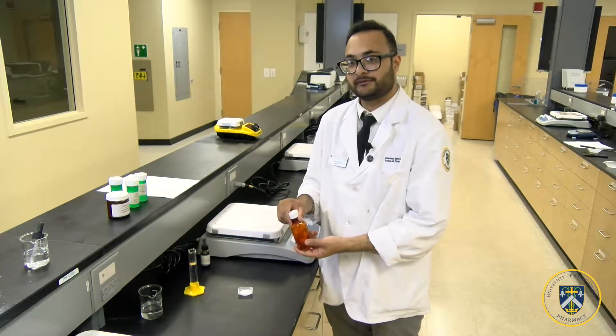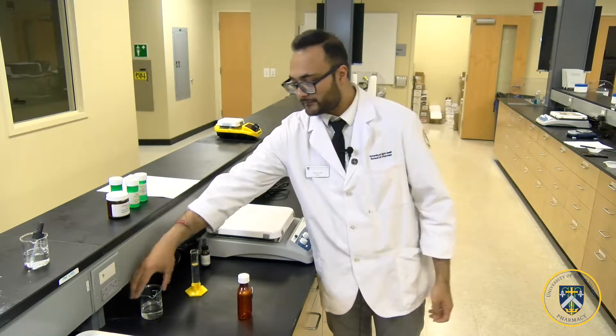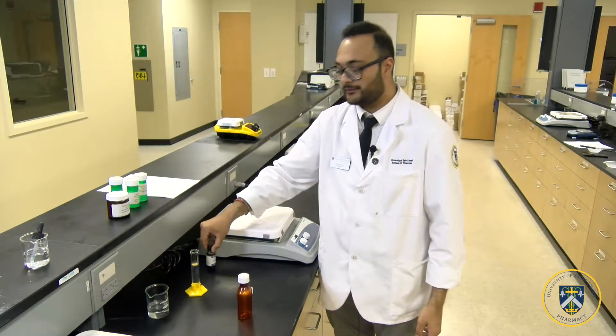To begin, assemble the required materials: one amber prescription vial (120 ml), one graduated cylinder, purified water, and flavor. And of course, vancomycin powder.